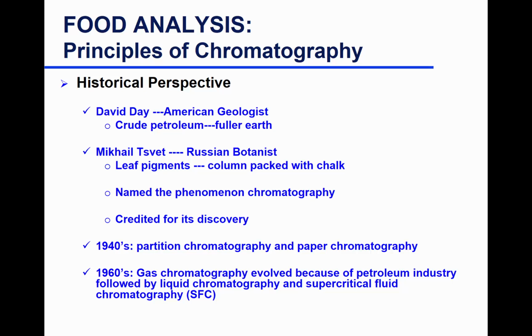In the 60s, gas chromatography became a hit, and it became an advanced analytical tool, and the equipment was more advanced. They discovered not just the use of the column, but also a lot of high-end detectors, and the system became more elaborate.